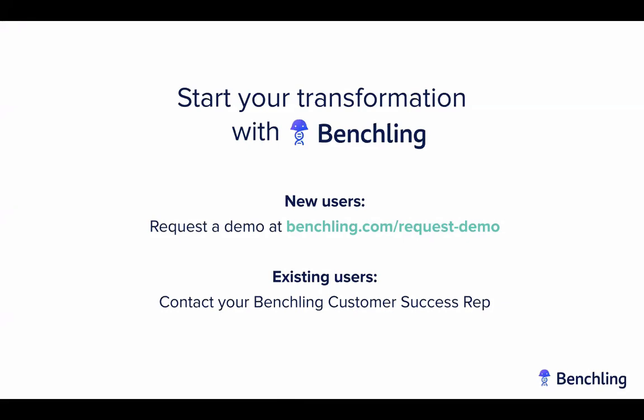Some people asked, can you create 300 alignments for 100 templates, or how do I bring in my libraries and proteins? When companies are operating at scale, or if they have their own registration system, what they often do is sync that with Benchling. So there's a two-way communication between what's in their registration system, whether it's fragments or parts or primers or what have you, to be pushed into Benchling, and then what's generated in Benchling to be pushed back into their own core system.